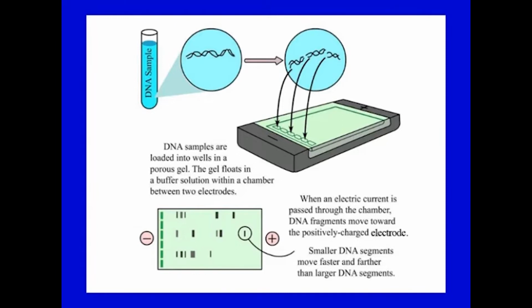So, with a pipette, you load the sample into the well. The sample is prepared in a certain high density solution, like a sucrose solution, or maybe glycerol, so that your sample settles down and does not float or diffuse in the buffer. It settles at the bottom of the well.